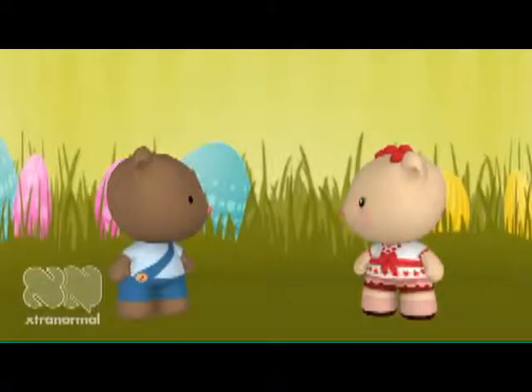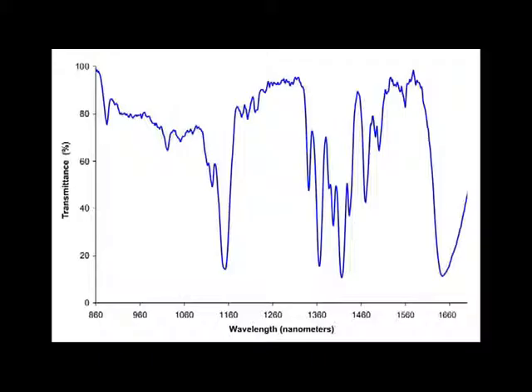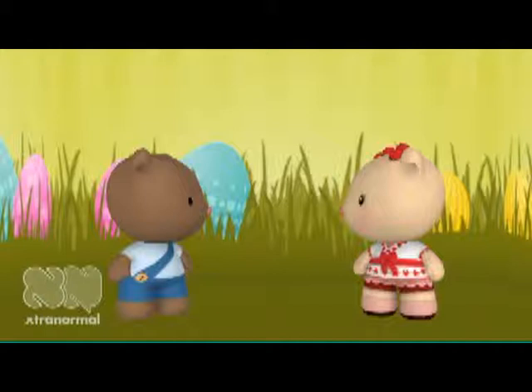I am back with the results. Here is the graph. From what I can see, the regions that peaked are those of the chemical compound dichloromethane, a substance that is highly toxic to animals. Also, I found a few strands of grass within the sample. That could mean the dog ingested it when he ate the long grass.